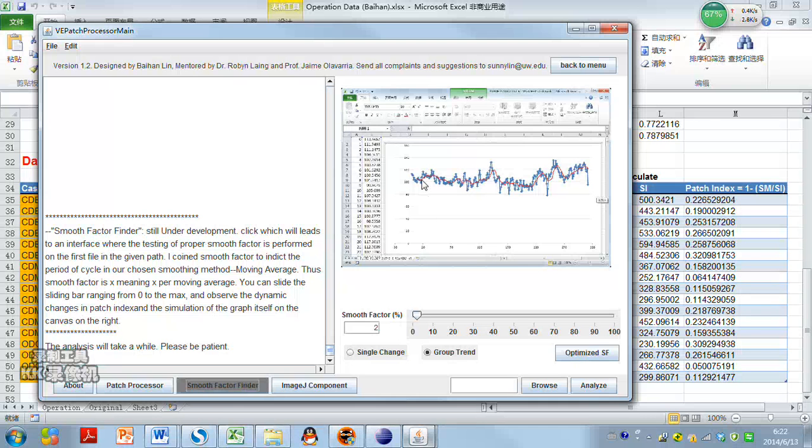Moving average means each data point becomes the average of the previous n data points. So it basically evens out individual outliers and stuff like that. Here we can see the Excel-generated moving average. The original data is very bumpy, but using the moving average it becomes more even, which is awesome.